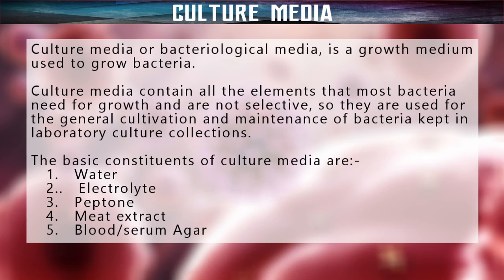The culture media which are used for growing bacteria are called bacteriological media. This bacterial culture media is used when a specific bacterium must be grown in order to confirm the presence of an infection or study a specific bacterium further. There are thousands of different media used today.